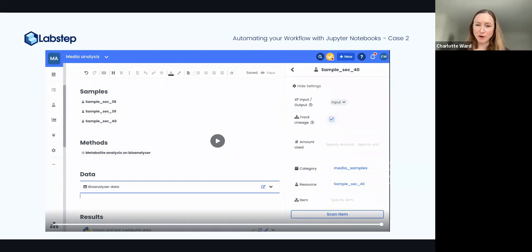What I would recommend for any users, if you want to keep track of versioning of scripts, is to use our protocols feature, because you can write the scripts within a protocol, like I've shown them being written in an experiment here, and then we can use versioning with protocols in order to save different versions. Cool. Don't know if we had any more. Hopefully that answered that individual's question. Yeah, it should have. Just give it a second in case it hasn't.